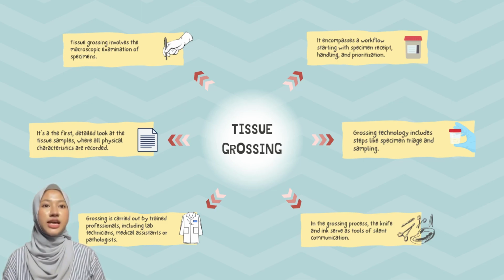Grossing technology includes steps like specimen triage and sampling. Specimens are managed carefully from receipt through to embedding, with each step designed to maintain their integrity for later analysis.